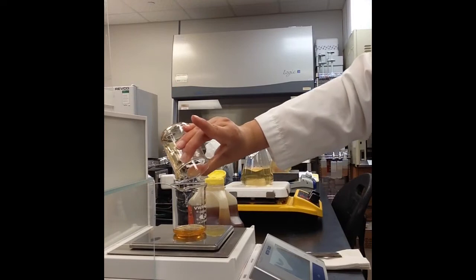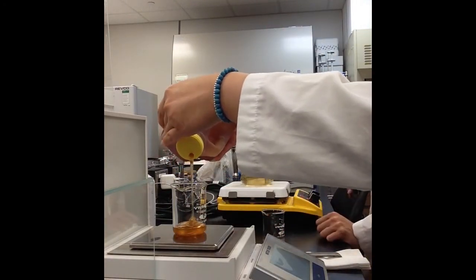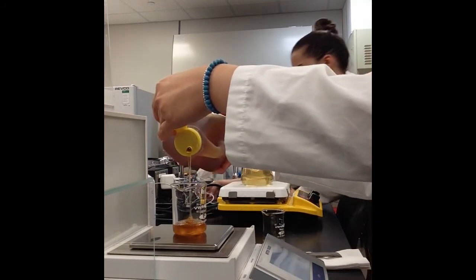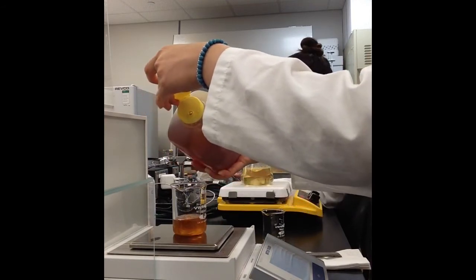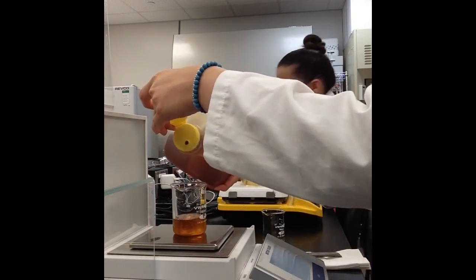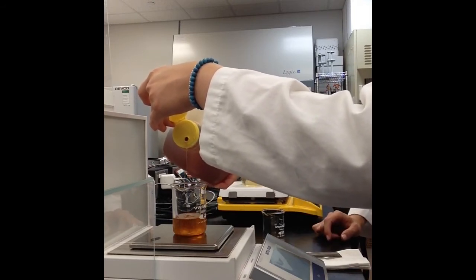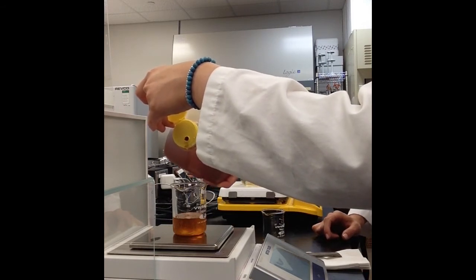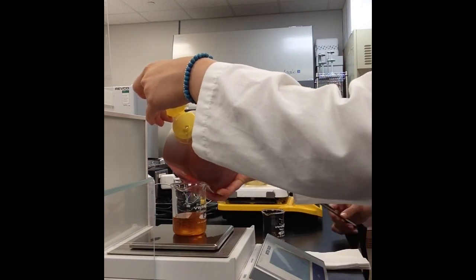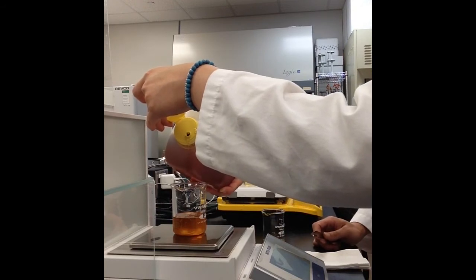For 5% concentration, we measured out 12.5 grams of each, honey, agave, and molasses. For our 10% concentration, 25 grams were used. For our 15% concentration, 37.5 grams were used. For 20% concentration, 50 grams. 25% concentration, 62.5 grams. And for 30% concentration, a total of 75 grams were used.